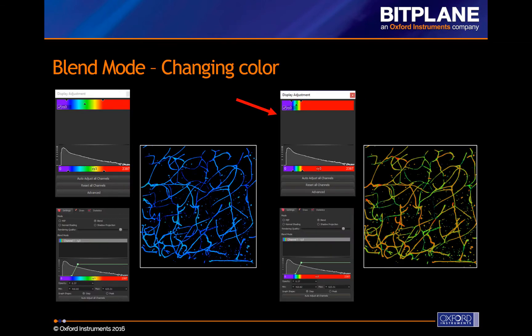Here is an example where the image's intensities are assigned a spectrum lookup table. The transfer function for the Blend Mode settings was not changed on the right compared to the left. Therefore, the same voxels are rendered at the same opacity levels. However, the display adjustment maximum threshold was changed, so the colors assigned to those voxels are now different.